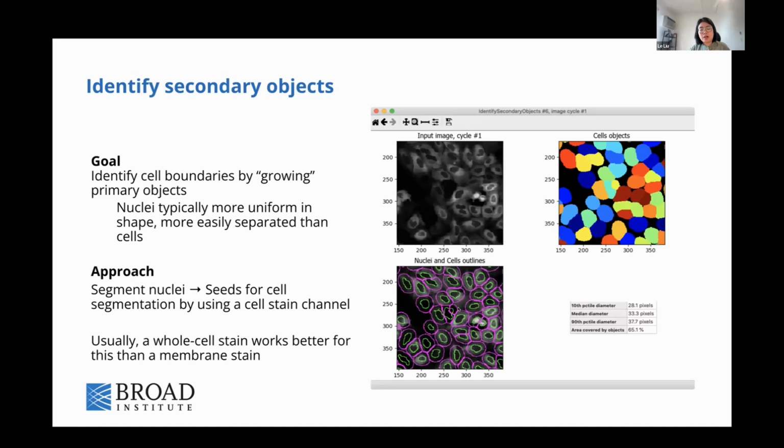The logic of the CellProfiler pipeline design is that we assume there is one nucleus and we find it, because it's easier to get good staining of the nuclei and easy to get from the DAPI channel. It's based on the assumption that one cell has only one nucleus. So if your samples have no nuclei or double nuclei, this pipeline may not work well.